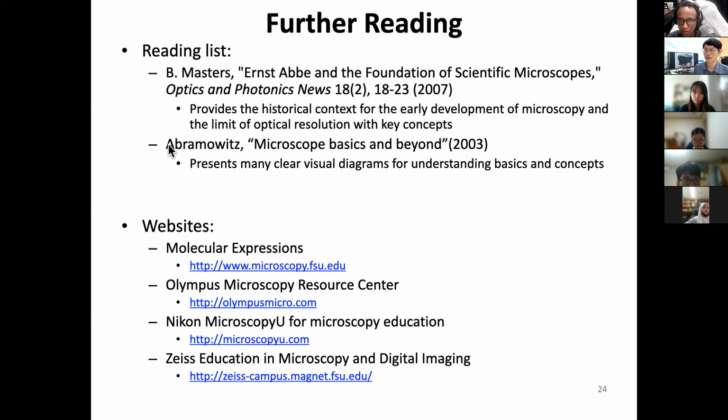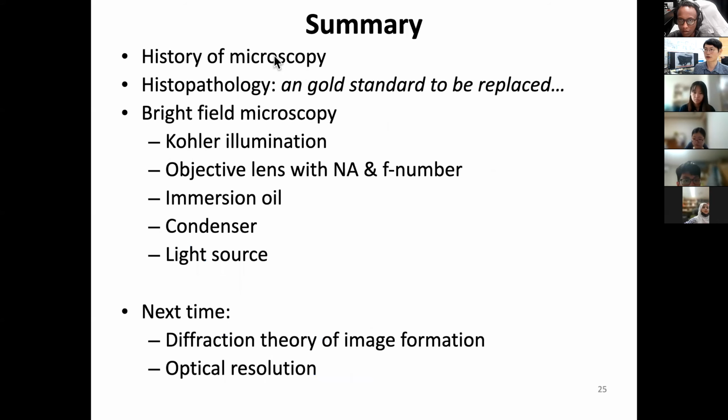All right, so that's the summary: history, histopathology, bright field microscope. Now I think we're going to diffraction theory and optical resolution.